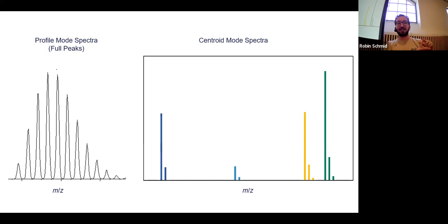And I just want to highlight that there are so many things that can go wrong. We had some TOF data from one vendor that was centroided and also recalibrated, and then the raw data was recalibrated, but the metadata was not. So if we had an MS2 scan, we usually select an ion, and that was linked to the MS1 spectrum. Now if we just recalibrate the data, but we don't recalibrate what the precursor m/z says, it's very hard to connect the dots and to connect everything. And this was really during the mzML conversion.